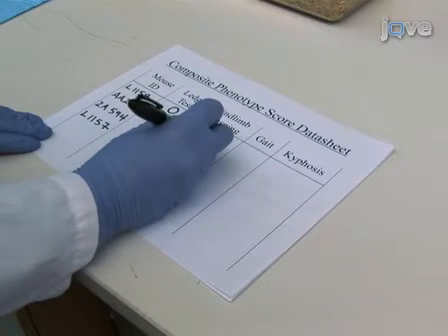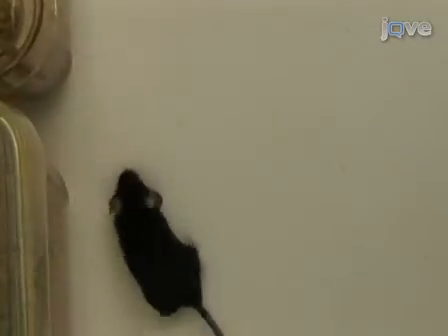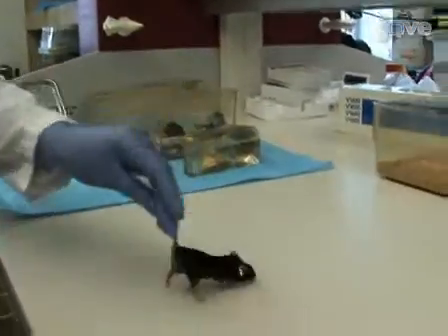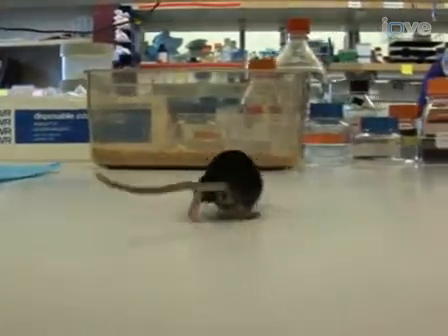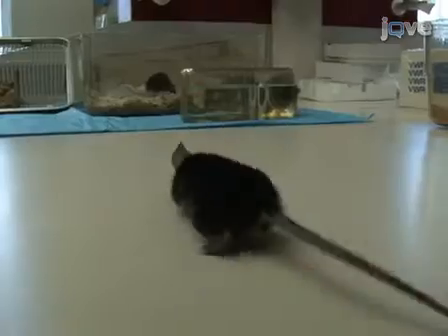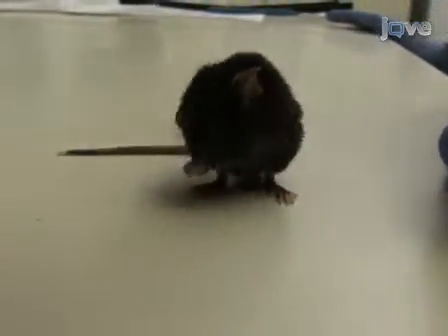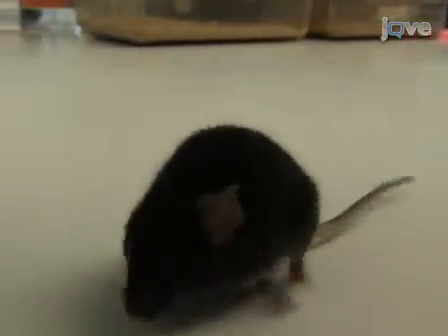Now let's see how to assess gait. The gait test is a measure of coordination and muscle function. To begin the test, remove the mouse from its cage and place it on a flat surface with its head facing away from the investigator. Observe the mouse from behind as it walks. If the mouse moves normally, with its body weight supported on all limbs, with its abdomen not touching the ground, and with both hind limbs participating evenly, it receives a score of 0. If it shows a tremor or appears to limp while walking, or its feet are slightly pointed away from its body, it receives a score of 1.